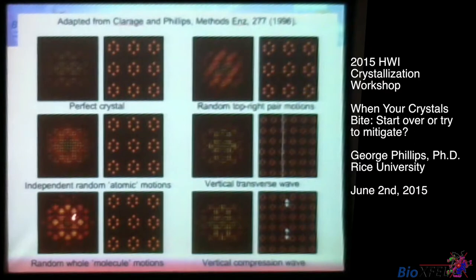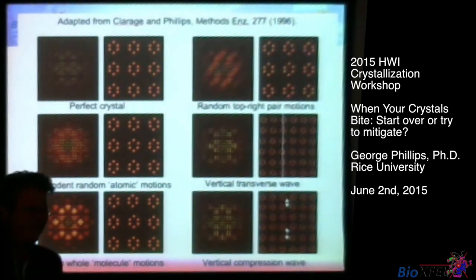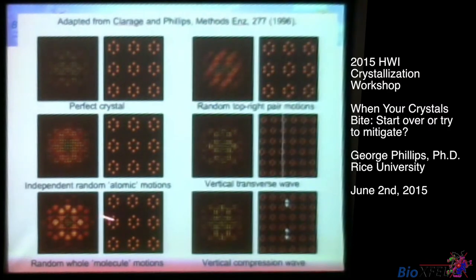And so if you see things in the background of your ugly crystals and you can see a diffraction pattern in the background, that's the diffraction pattern of the part that's moving as a block. There are examples of this where you can see a fiber pattern of DNA in the background of a protein crystal. There are examples of this where you can see evidence of coiled coil in leucine zipper type proteins. There are numerous examples where you see the other case in your checkered past where you saw that. Yeah, that's right. Exactly. I may get to that if I don't run out of time.